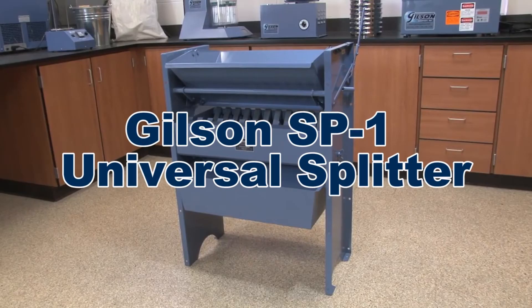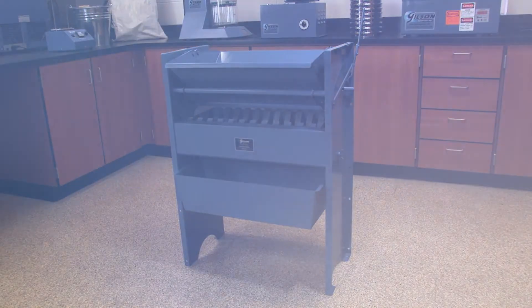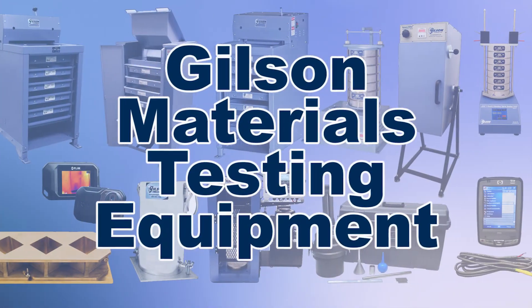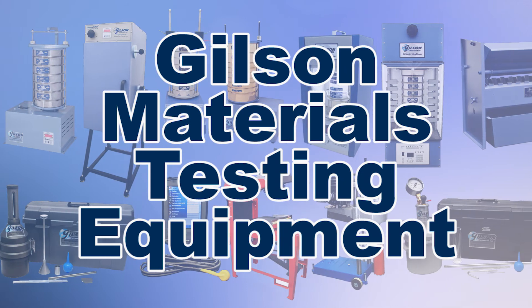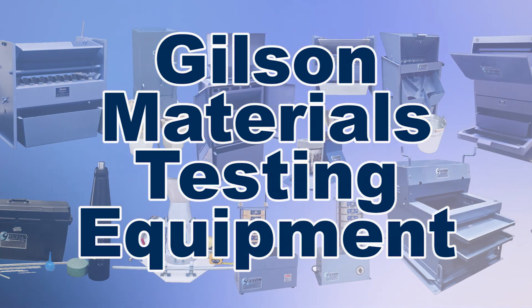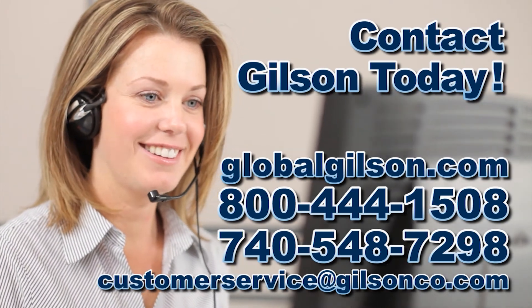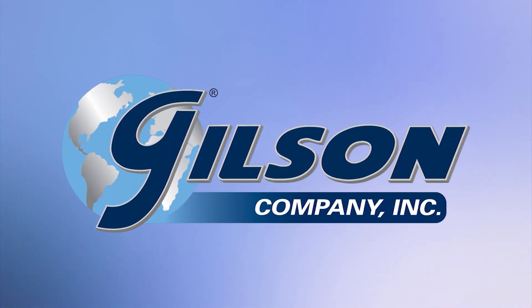Making the Gilson SP-1 Universal Sample Splitter the right choice for your materials testing lab. With Gilson's complete family of materials testing equipment, offering a wide range of performance, features, and capacities, Gilson has the right equipment for your accurate representative sampling needs. Be sure to check out these and all our products listed in the Gilson catalog and on the Gilson website. Gilson — your industry leader for materials testing equipment.